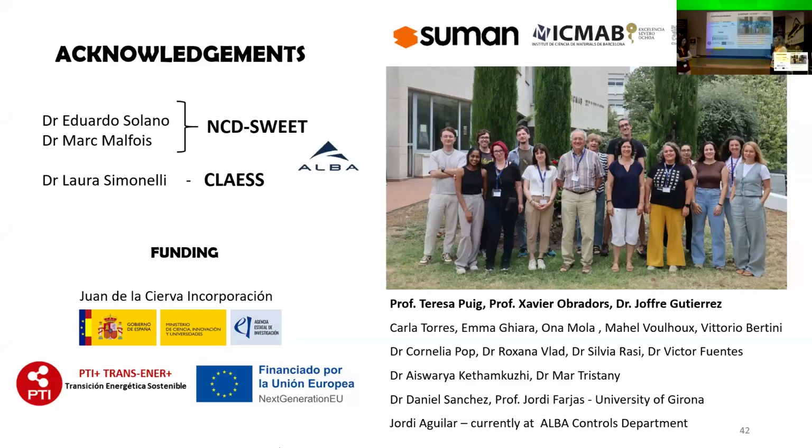Probably the first layer, I don't know if you could see the first layer. The beam size is around 200 microns. But I mean the sensitivity of the signal. I mean the X-ray diffraction, because you need a correlation length, right?